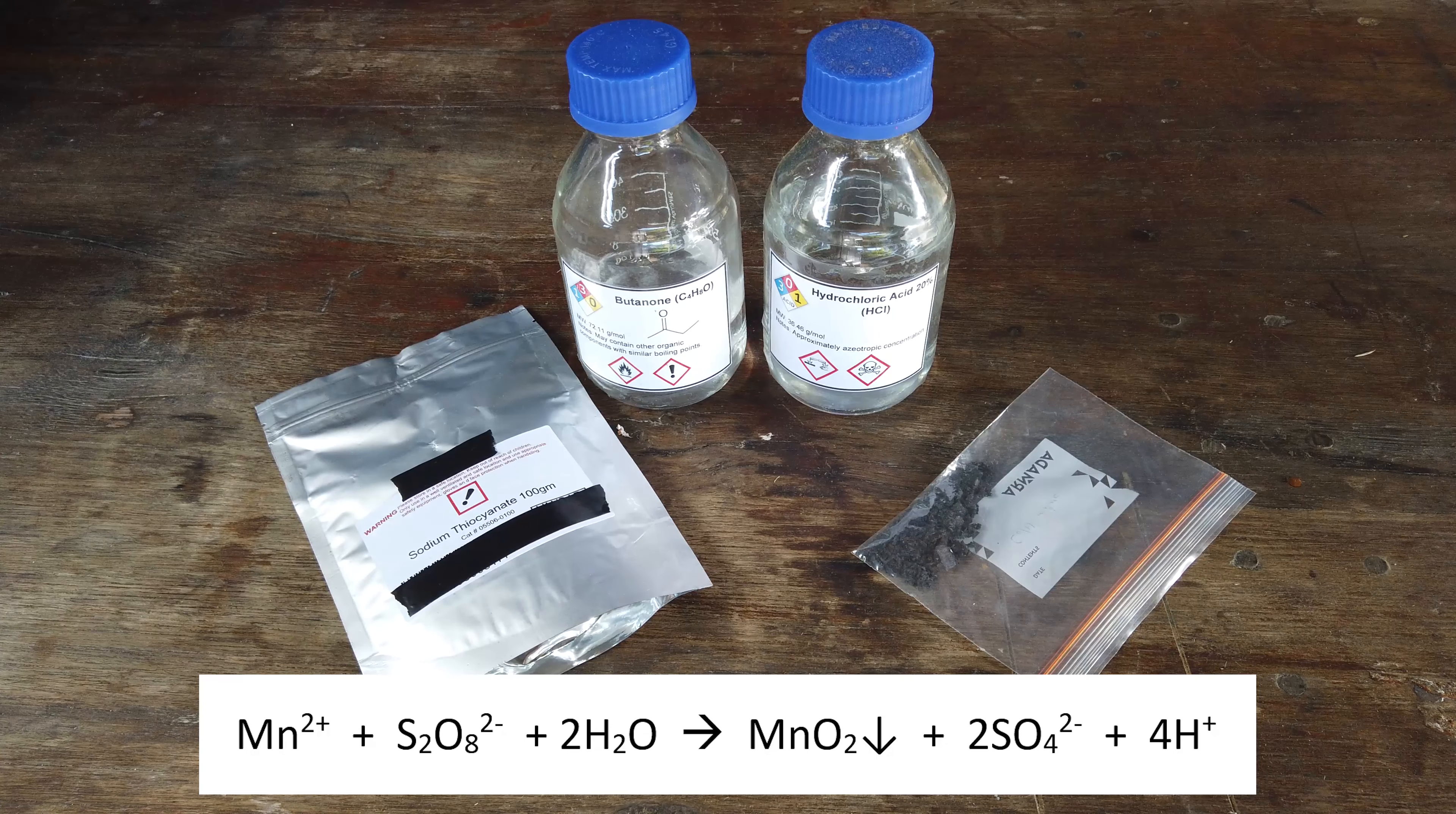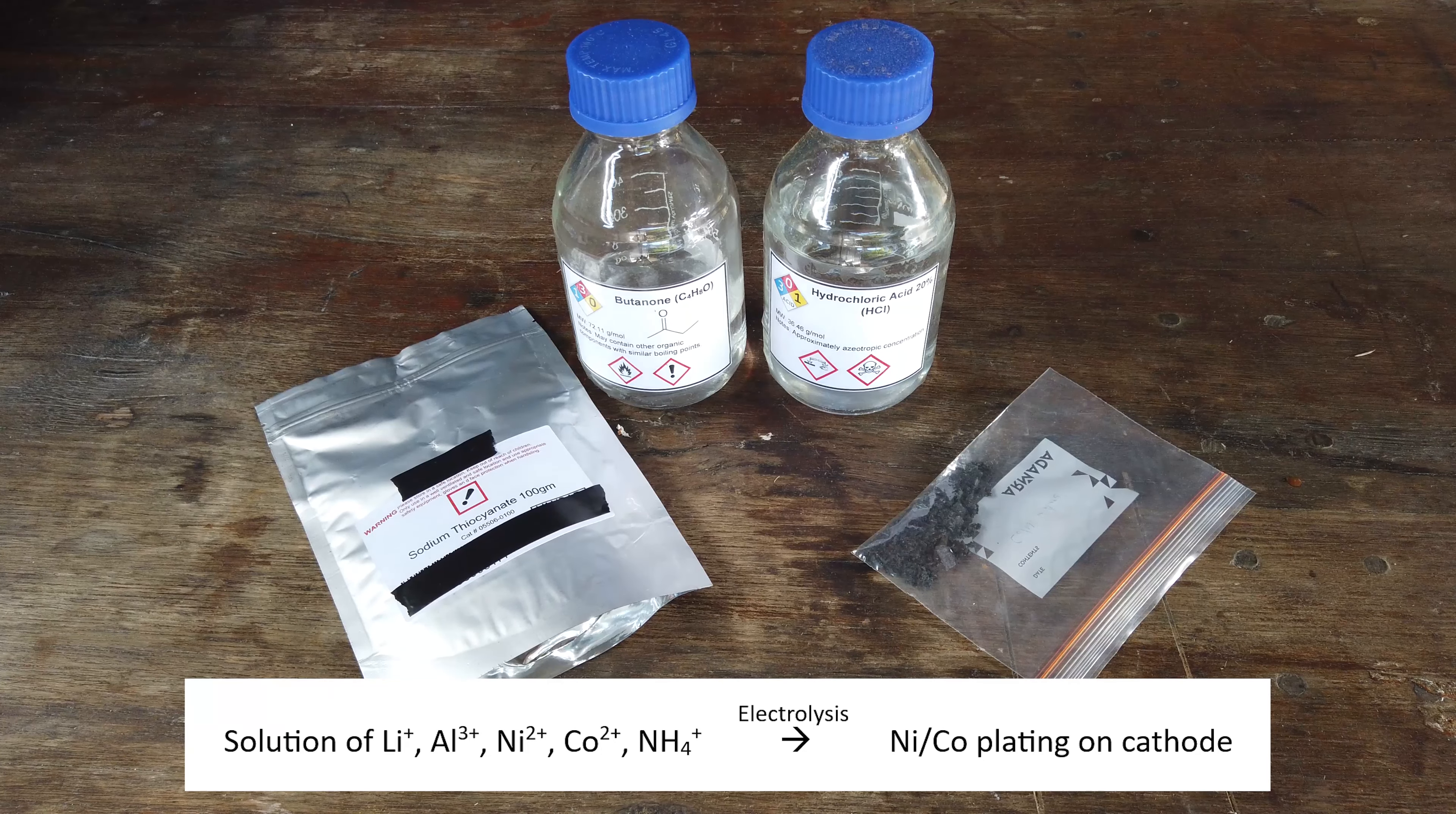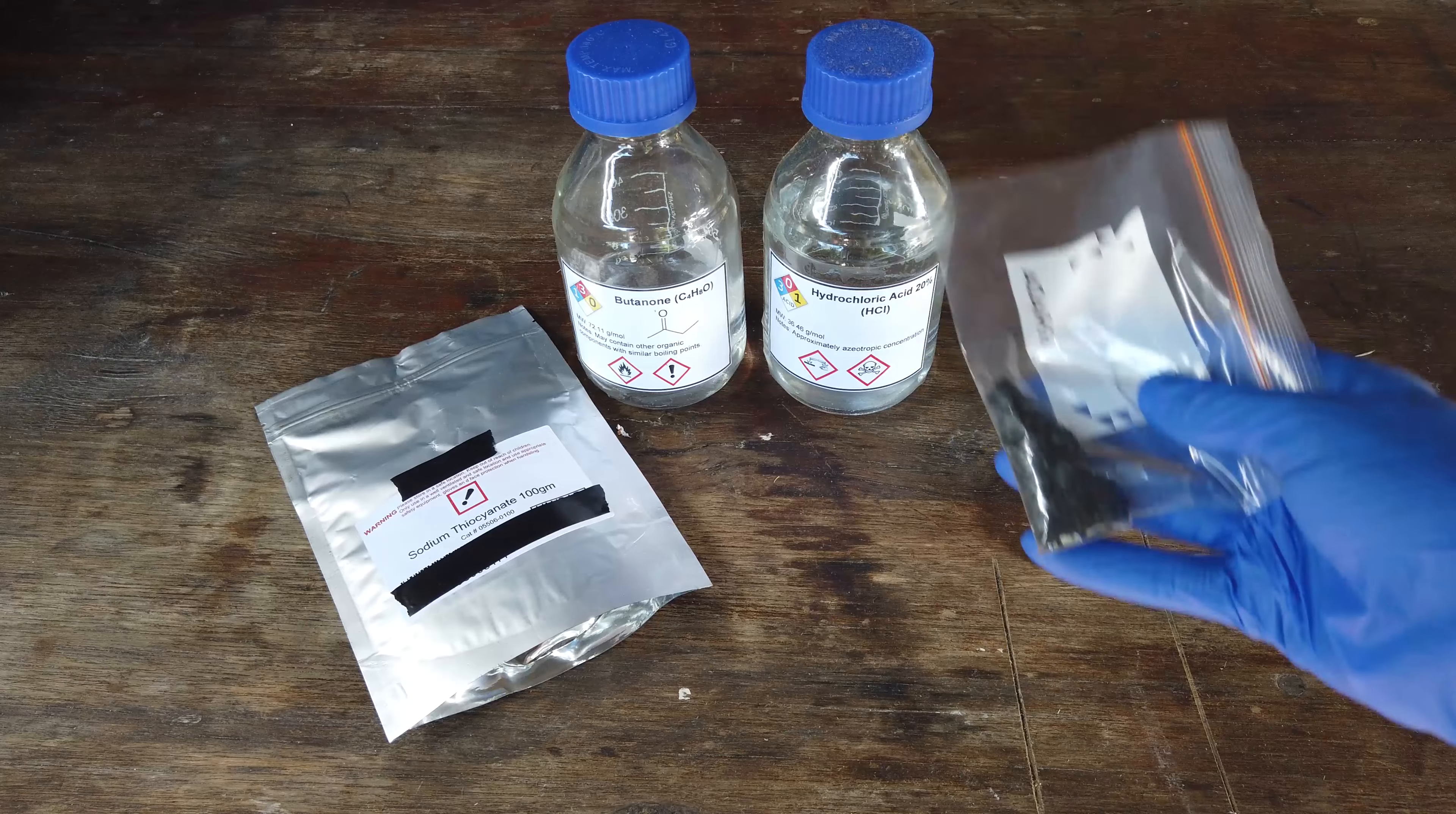With trial and error, the next step was an electrolytic process for removing the rest of the transition metals, specifically cobalt and nickel. We slowly electroplated them onto our cathode to produce a metallic mixture of cobalt and nickel. The small sample from the last video, about 10 grams, is right here, and that's what we're working with today.